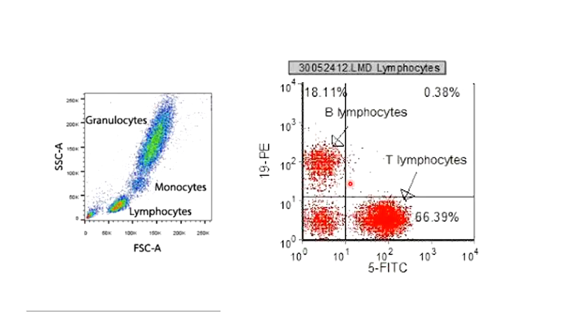So a similar thing can come into flow cytometry. If you are adding 2 colors or 2 fluorescent molecules, it is fine. Maybe their wavelengths will not overlap with each other, but adding a 3rd color, you are increasing overlapping. 4 color overlapping, 5 color overlapping, 6 color overlapping, 7 colors more overlapping, 8 colors. Imagine what will happen if you are utilizing 18 different fluorescent molecules in the same test tube. So it is difficult to analyze the data of complex experiments, because in a complex experiment you try to understand multiple proteins at a time, or multiple fluorescent signals at a time.